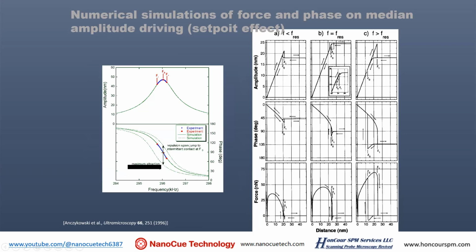Some graphics, and then if you put the driving frequency below, and then you engage, it is much more tight, and then you're actually guaranteeing a repulsive force, because if you look at the phase, it's mostly up. The force is also increased. But if you put the driving frequency on the right shoulder, the engaged force and pull force are actually separate.